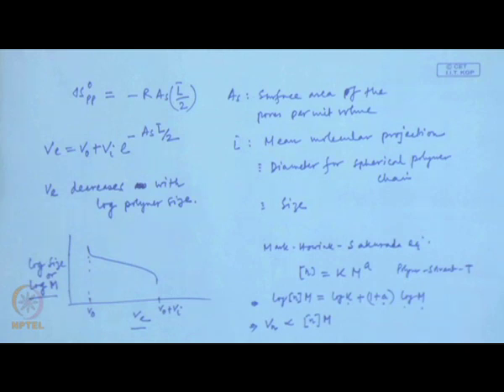This is what is found in practice when we inject different molecular weight samples in the GPC column.